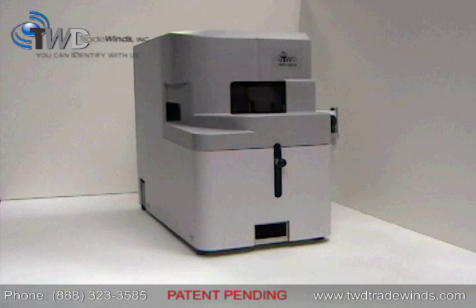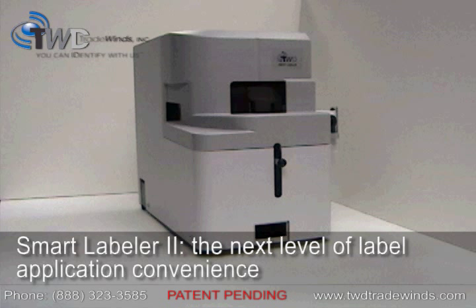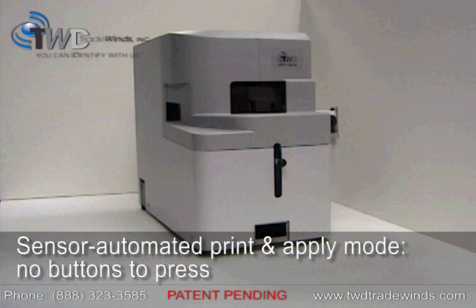If your laboratory is labeling greater than 50 to 100 parts per day, the Smart Labeler 2 model may be more suitable for your application. It features a labware sensor that automatically triggers the software to print and apply a label whenever a part is present.